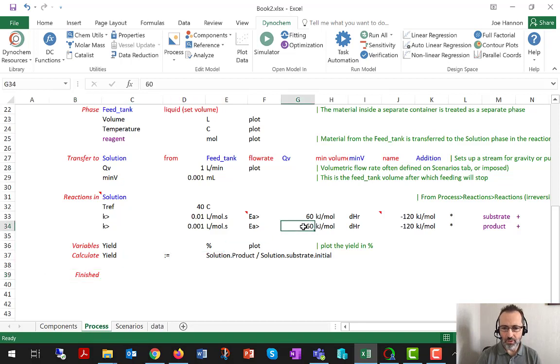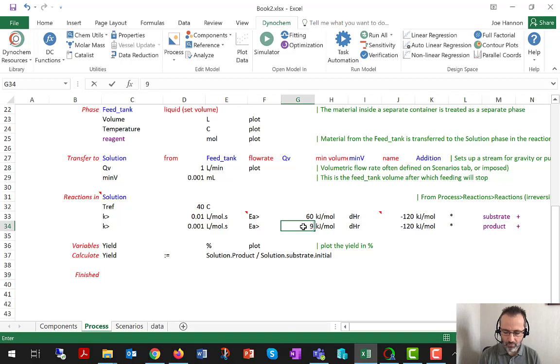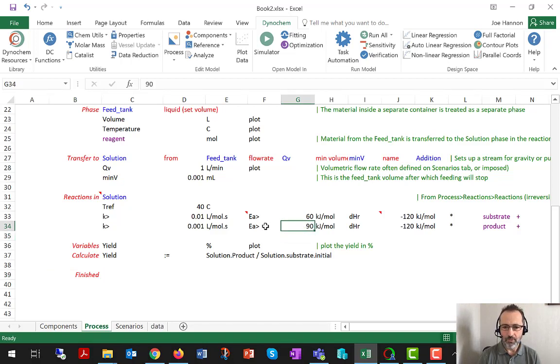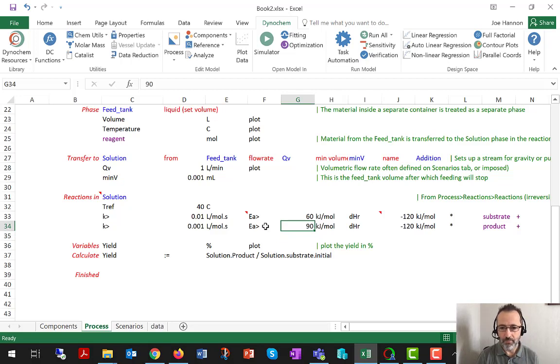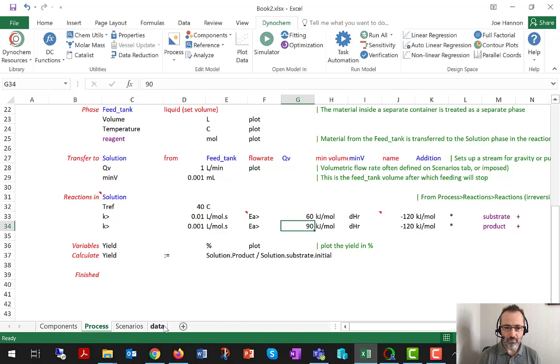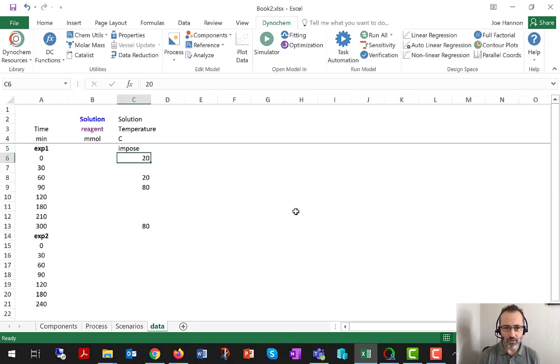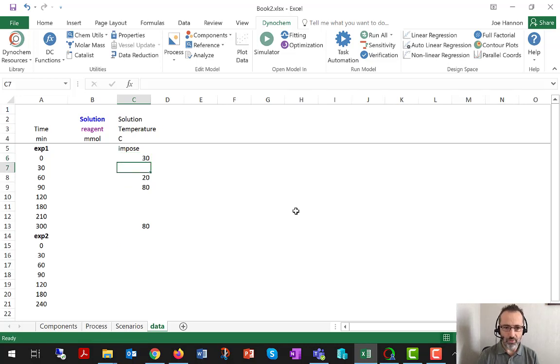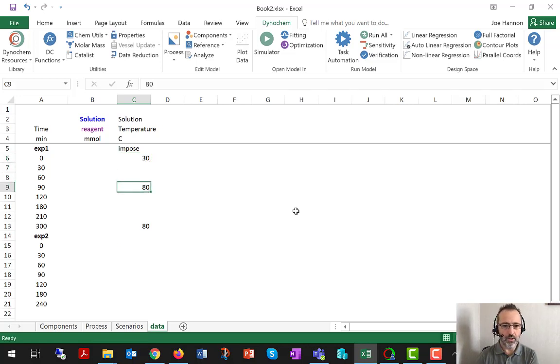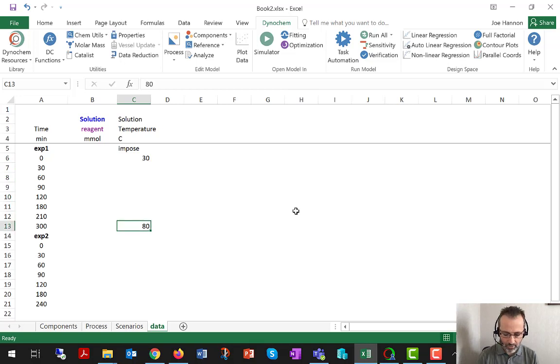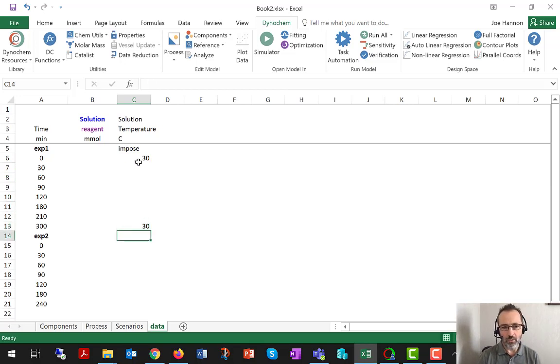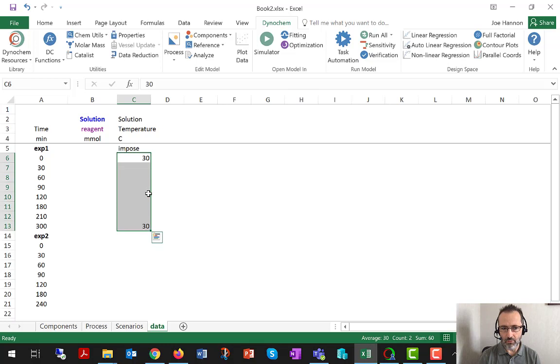Just because we noticed in earlier sessions a few numbers that possibly should be different, I'm just going to permanently change the activation energy of the side reaction to 90 kJ per mole. And that's a bit more typical for a difference between the main reaction and side reaction. I'm also going to impose just a solid 30 degrees reaction temperature, because again, we noticed that was better for this particular reaction.